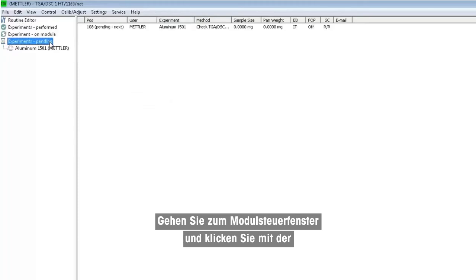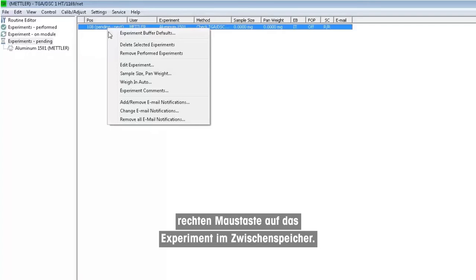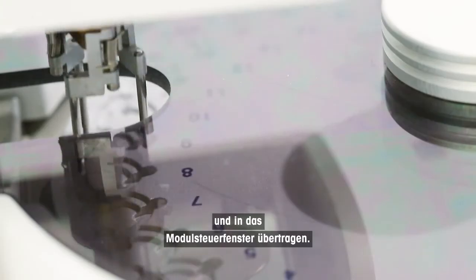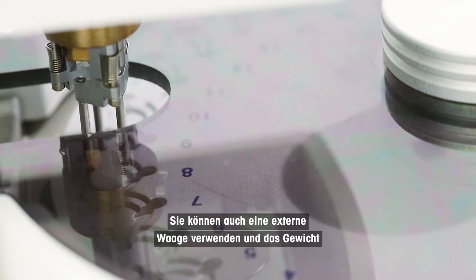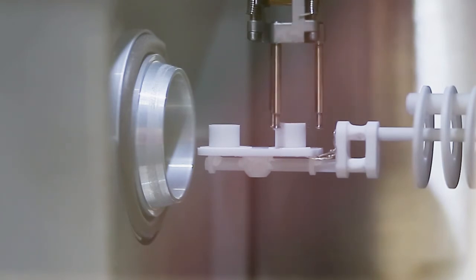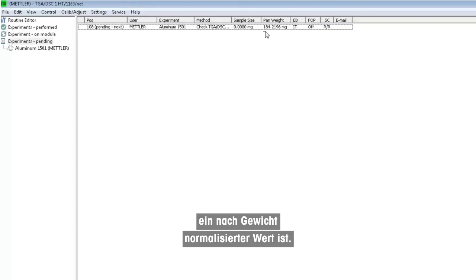Go to the module control window. Right-click on the experiment in the buffer and choose the weigh-in auto option. Choose pan and click OK. The crucible weight is now automatically determined and will be transferred to the module control window. Alternatively, you can use an external balance and enter the weight manually, or do this manually on the TGA balance. Accurate weight determination is necessary for heat flow calibration, as the melting enthalpy taken is a value normalized by weight.